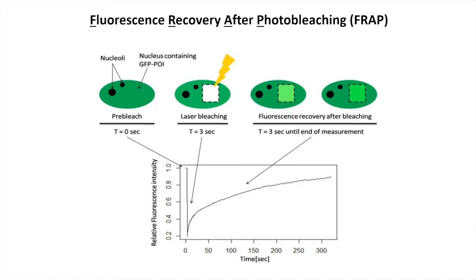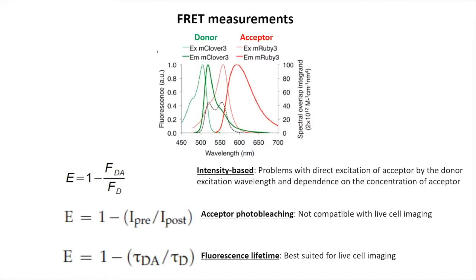That's good, but it's on more of a microscopic scale. Another widely used technique that everyone is familiar with is FRET, fluorescence resonance energy transfer. Where you have spectral overlap between donor and acceptor, due to this overlap there's non-radiative energy transfer between donor and acceptor, and essentially donor emission as a result is quenched, it doesn't emit as well, and the acceptor exhibits sensitized emission.